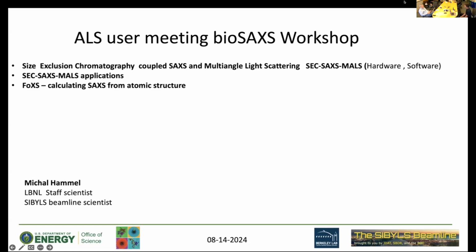I will talk a little bit about what we developed over the last, let's say, 10 years here at the SIBYLS, something about hardware and software, and some applications of size exclusion coupled SAXS and multi-angle light scattering. I know Josh is going to mention in the second part of our workshop more about determining structures with MD, but I will give a little introduction on how to use the data coming from size exclusion coupled SAXS using the FoXS calculator and crystalline structures.